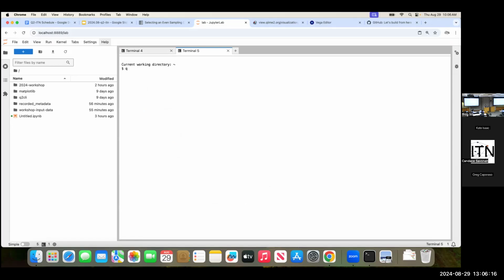All right, so here we go. QIIME tools replay provenance, and then it was --in-fp. Actually, I'm going to go back, because I'm not where you guys are. My directory right now is my home directory. So I'm going to CD to match you guys and get into the 2024. All right, now we should be matching. And now I'm going to do my command.